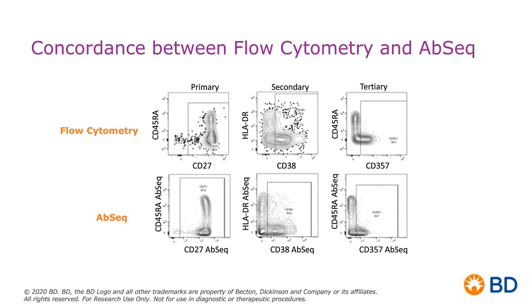We've removed that spillover and spreading error component, the thing that is very challenging when we're trying to build flow cytometry panels. And what does that mean? It means we can get really good resolution on the low end in high-plex panels. And of course, this is just examples of some of the data that we can get off of this particular platform. But I'm a little more interested in actually applying it to samples of interest. And that's what I'll be talking about next.